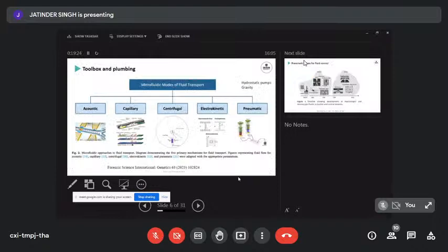So if we talk about our microfluidic modes of transport, this is a very nice paper to be reading. It came out of the Landers group, and most of the rest of this lecture will be coming from that paper, because what the Landers group has done is that they started, probably around 2001, 2002, when it was really cool to do DNA separations, DNA gel electrophoresis on a chip. And then people started dreaming that they wanted to have a field portable forensic system.